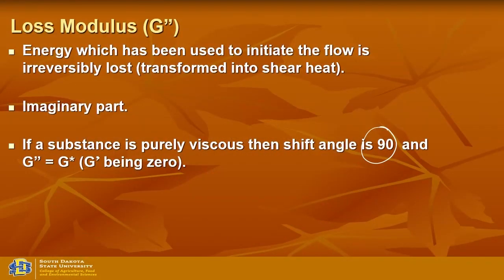But our materials are viscoelastic, so in any dynamic test you do for your sample, you get both G prime and G double prime: elastic modulus and viscous modulus, or storage modulus and loss modulus. So that is how you interpret it. Elastic, viscous, storage and loss.